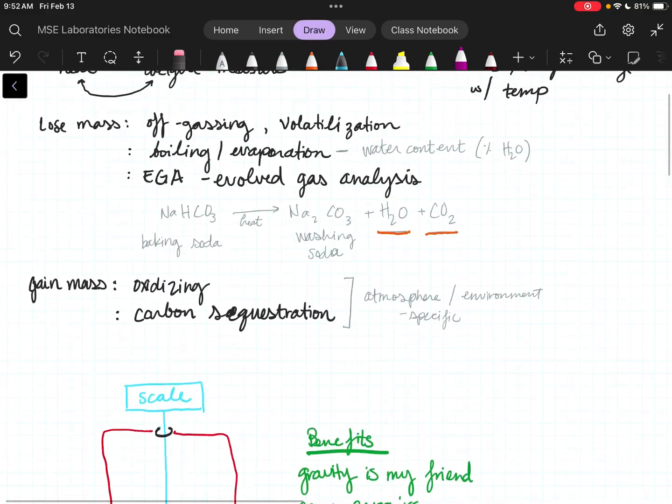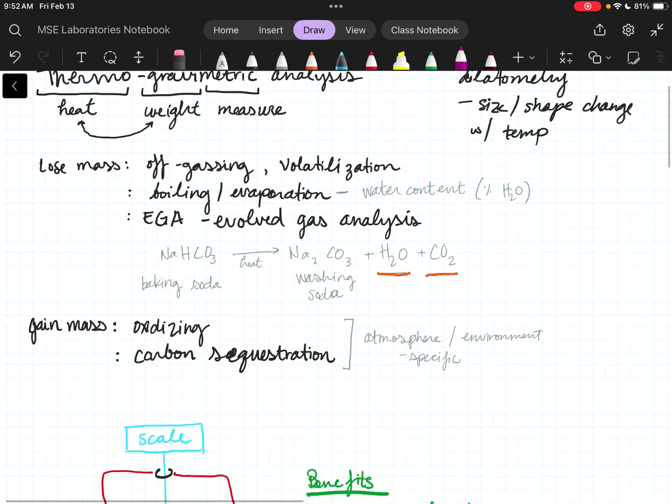DSC, and I have a whole separate video about DSC and the specifics of that. But DSC is, for us, a measurement of how temperature affects heat flow.